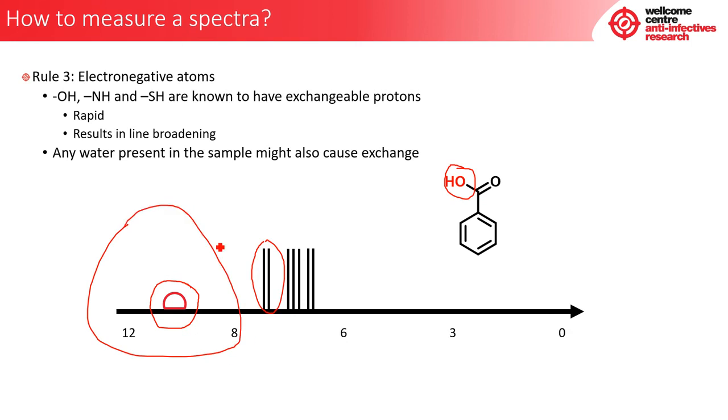That's fine. We then said, okay, peak splitting, how many neighbours does it have? And we look here to say, actually, it doesn't contain any neighbours. It's got a carbon, which is attached onto the oxygen species. So therefore, it should only appear as a single peak. But because now we know that OHs are exchangeable protons, we may see a single peak, but we may also see this line broadening because the exchange of these protons is very, very rapid with the sample.